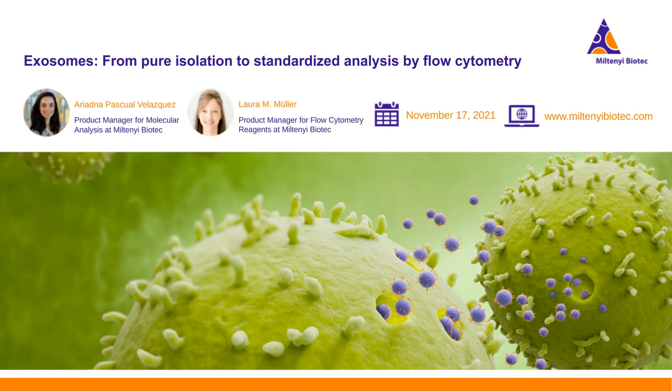What is the size range for the magnetic isolation beads? The graphics show them as small compared with EVs, but is this really true with respect to exosomes?